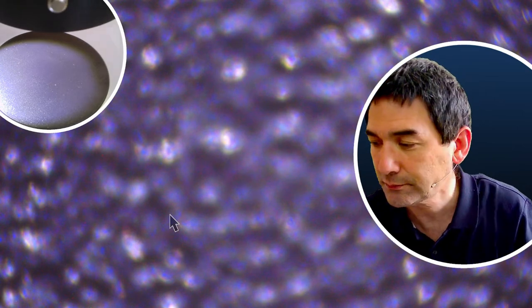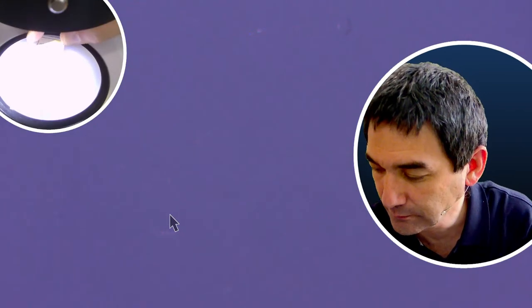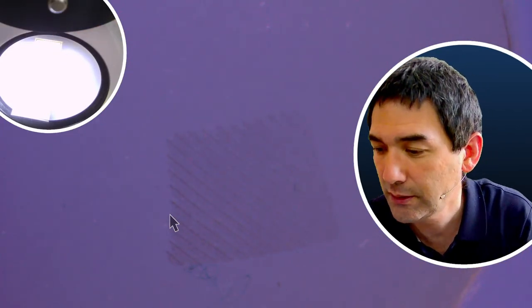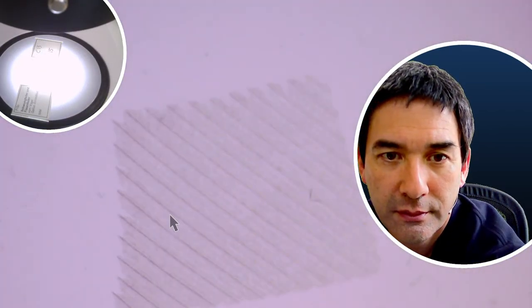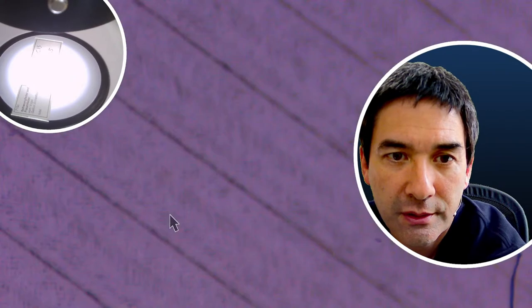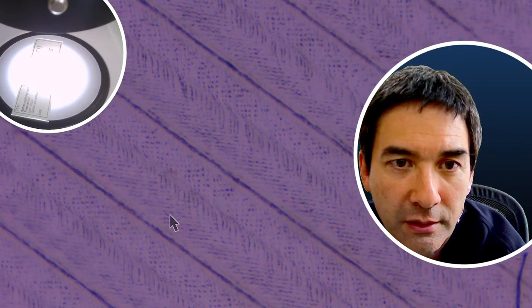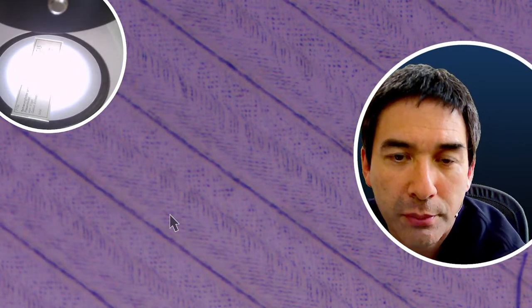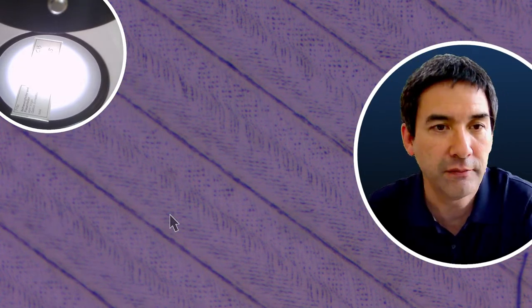That's a bird's feather — also very transparent. Let me turn on the light from the bottom. Here we're able to see the individual barbules. This is an example where the person who prepared the slide attempted to make it very transparent — therefore the contrast is a little bit low.